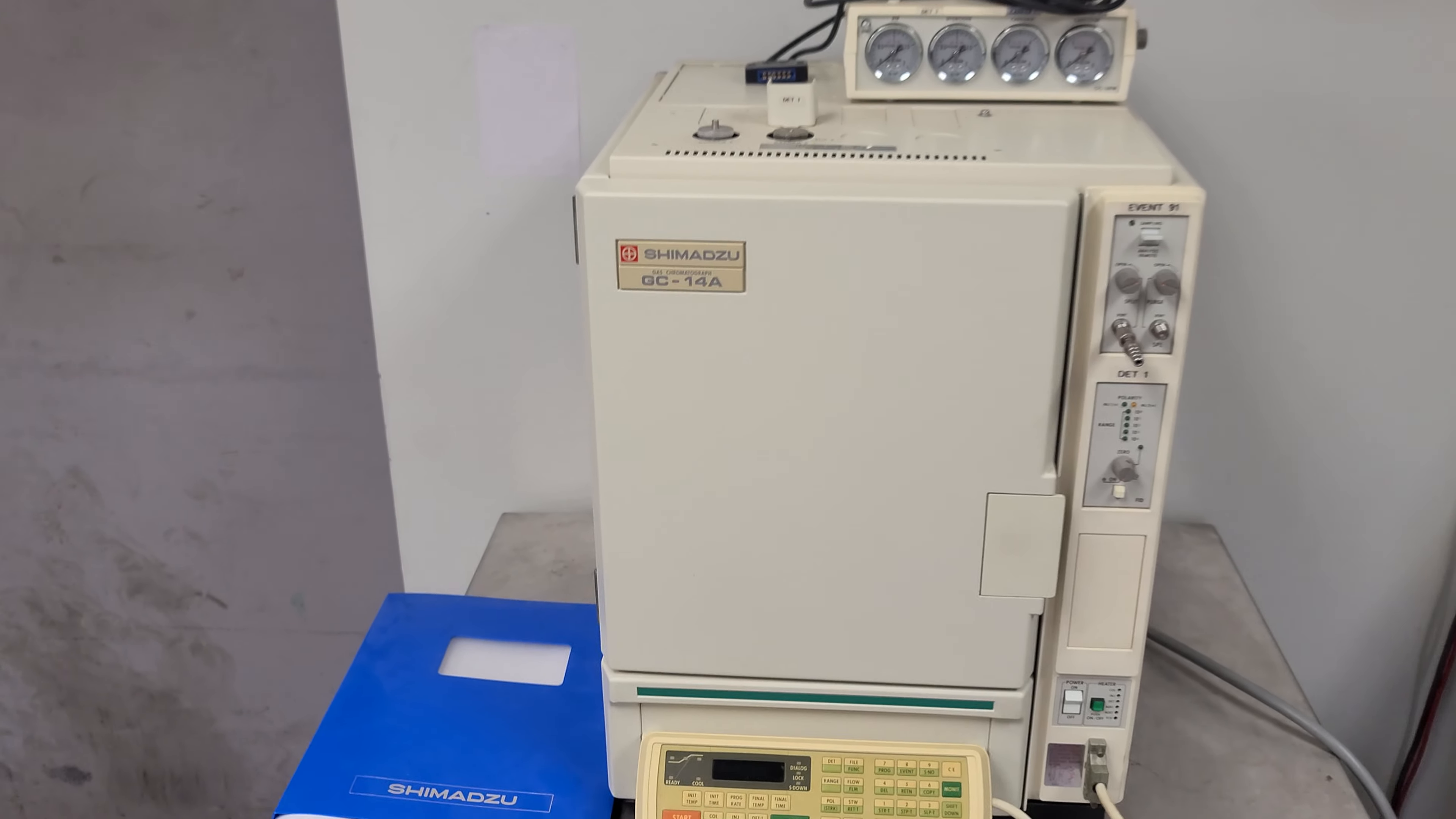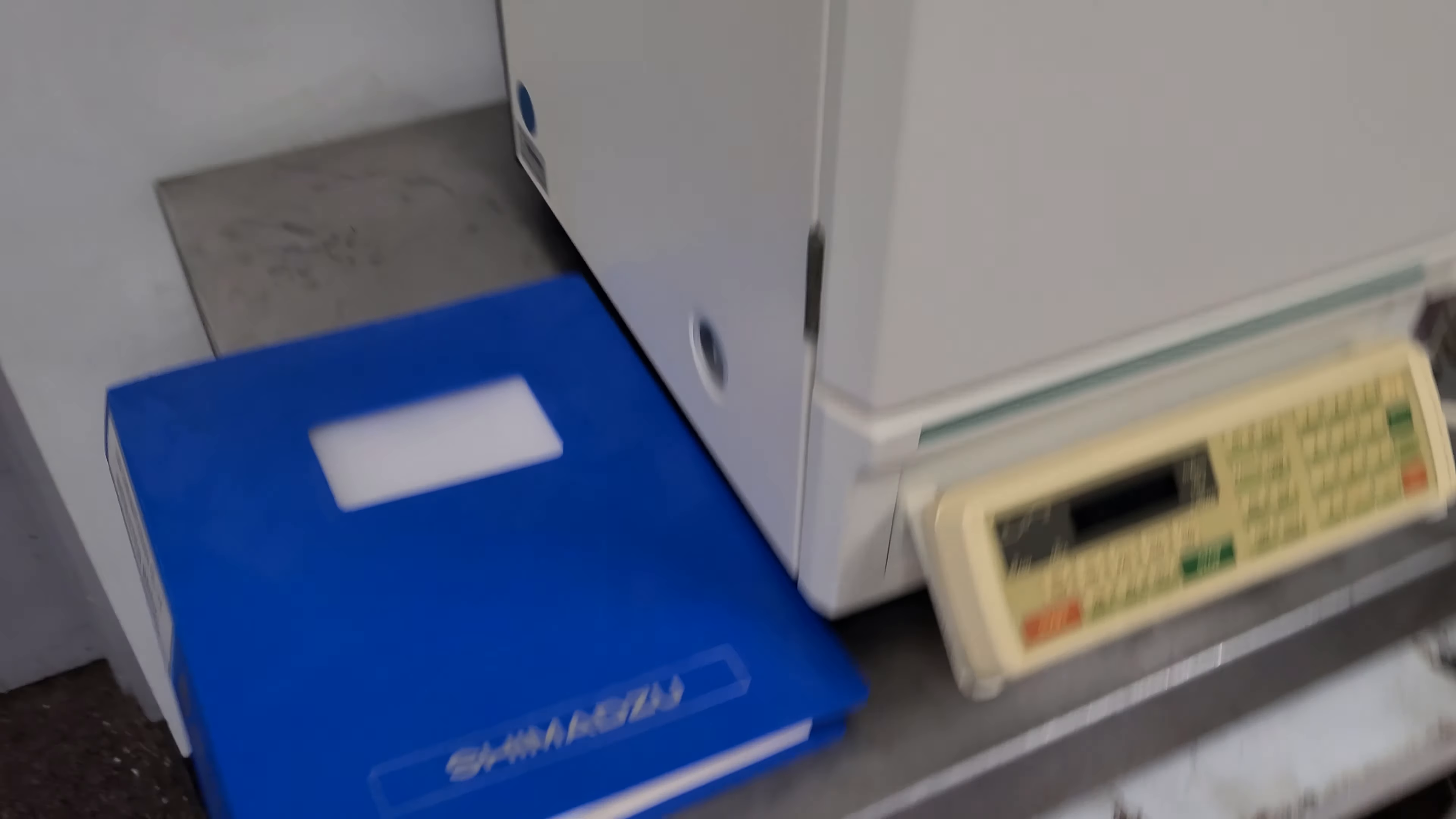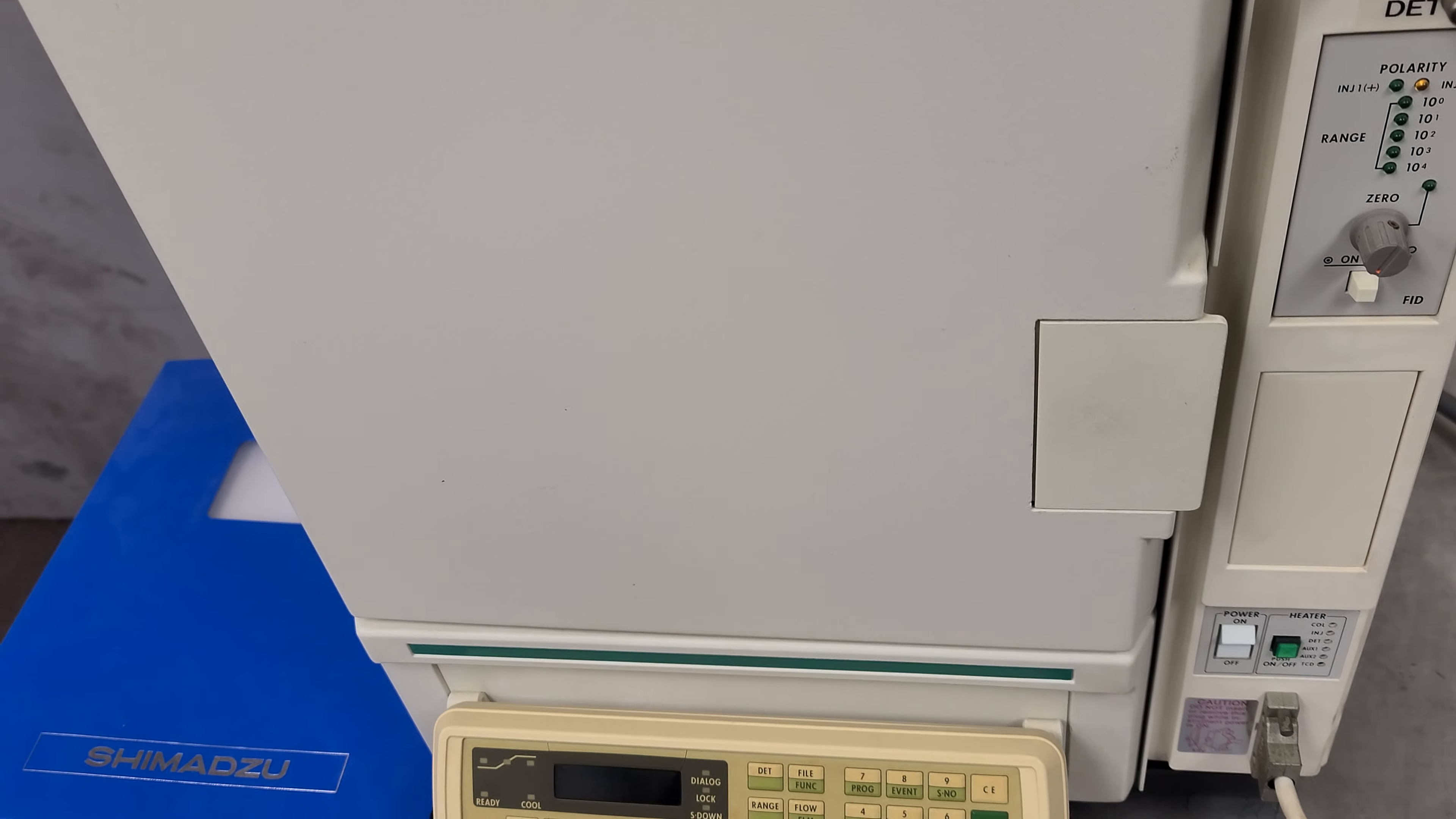This is a Shimadzu GC-14A gas chromatograph. It came out of a closed lab. It was hooked up, we disconnected it. It had a bunch of lines. These were all hooked up to cylinders which we didn't get, so hold those. This was hooked up to like a printer.